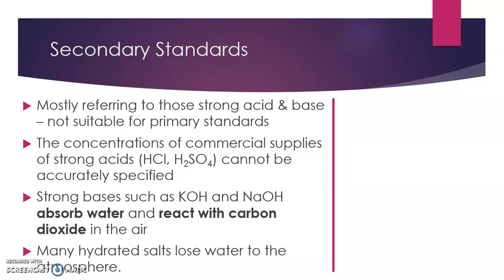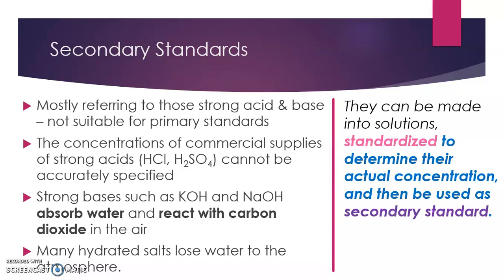However, that doesn't mean that we can't use them as standard solutions. What we need to do is make them into solutions and standardize them before the actual titration happens, right before. And for that reason, we call them secondary standard.